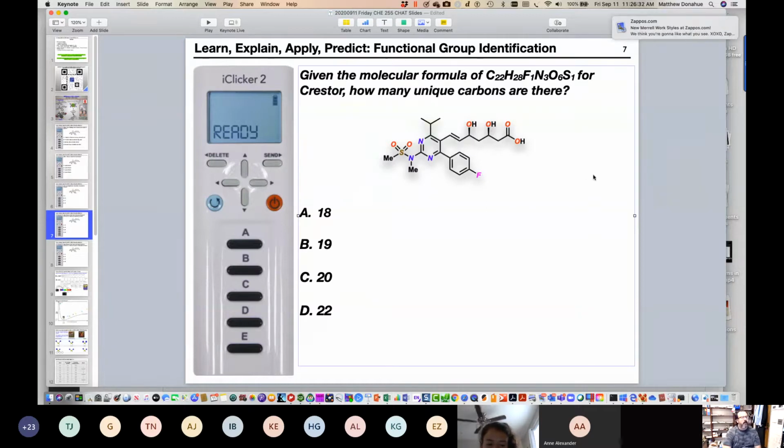The point I'm trying to make here is that even though all these carbons are sp2 hybridized, they reduce the count from 6 for a couple of reasons. These don't have any hydrogens. These each have 1 hydrogen, but they're different due to their relationships wherever you stand. If you're standing here, those are the same.